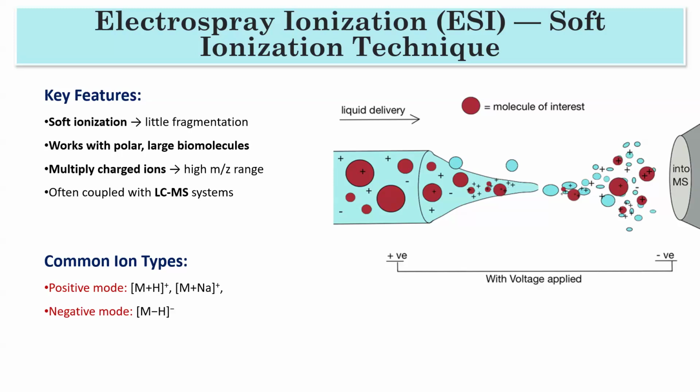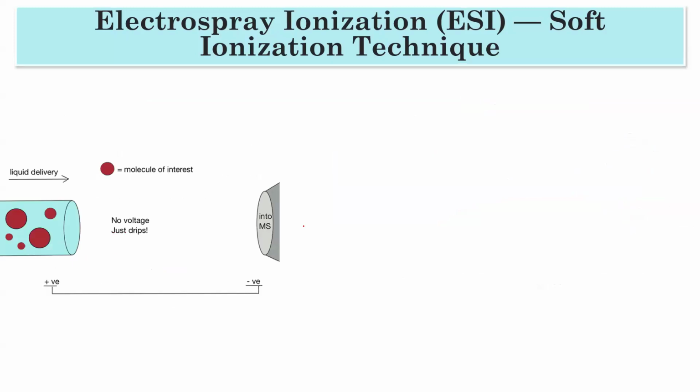Anisa is asking where ESI is used. I will talk about tandem mass spectrometry. Someone is asking whether there is any website that tells which fragment ions will form. I think it's available, but it's not easy to get the exact fragmentation. Anyway, let's move on.